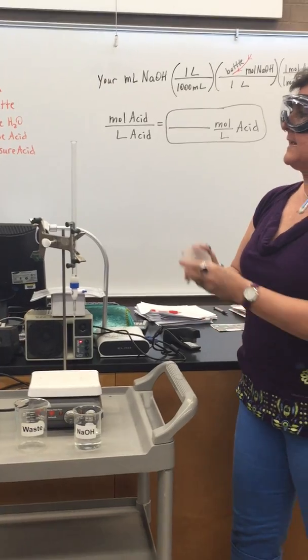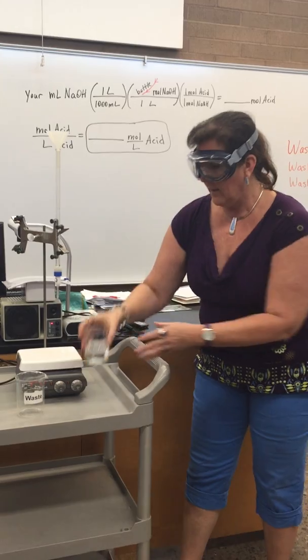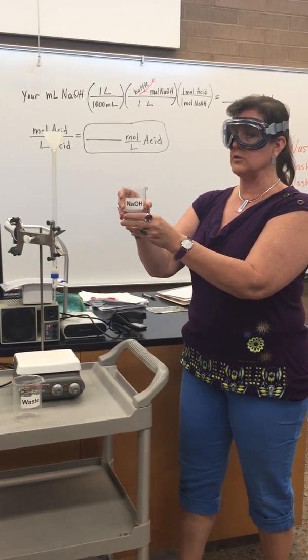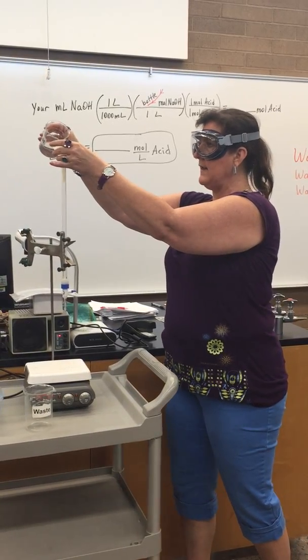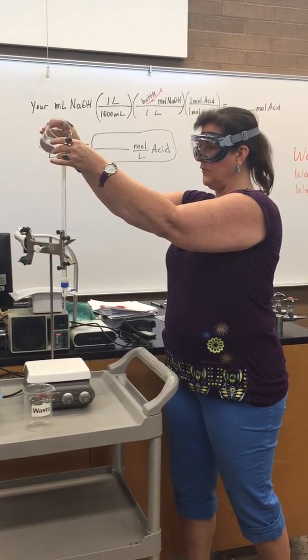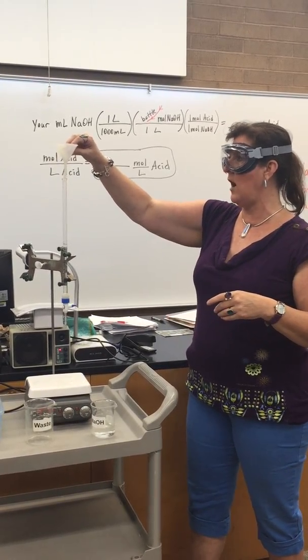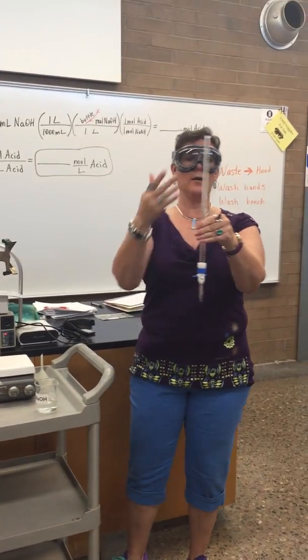Now I need to rinse the inside with sodium hydroxide. I'm going to grab my funnel, put it on top, and I have some sodium hydroxide. Careful with this — it's a strong base that I have already collected. I'm going to pour a little bit in here. Not too much; you don't need to fill it up all the way. Take the funnel off.